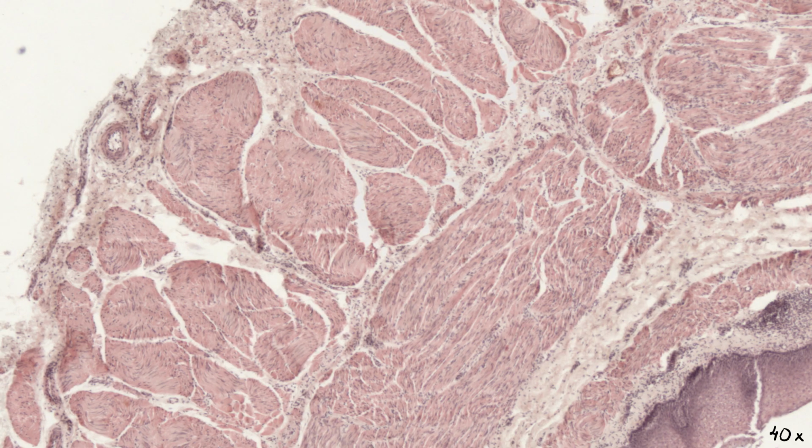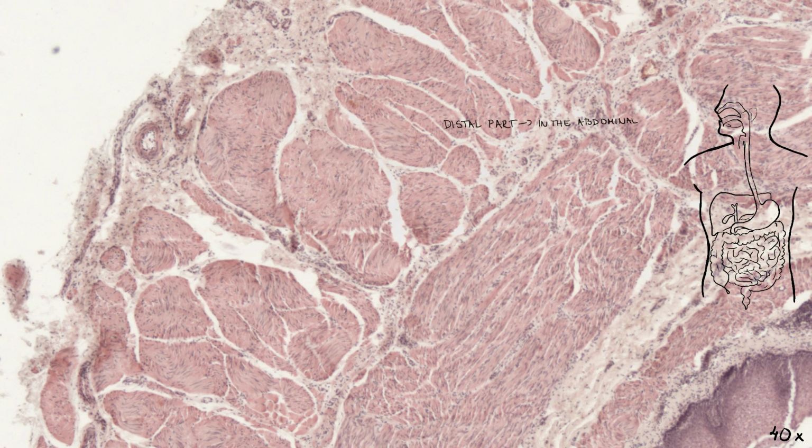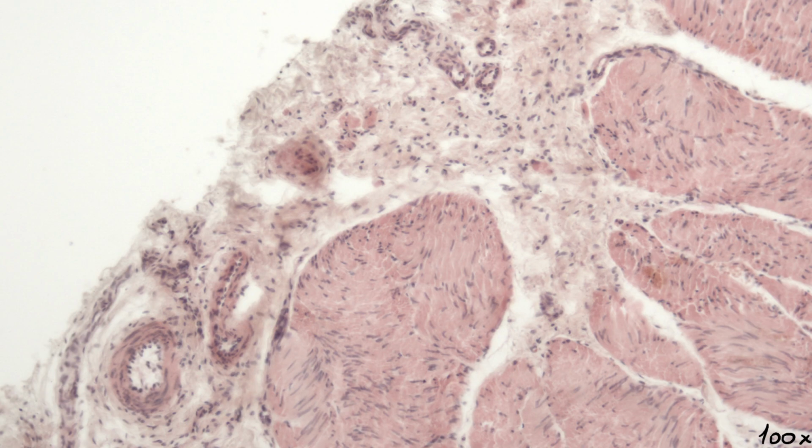Distal section of esophagus is located within the abdominal cavity, where it opens into stomach. This part is covered by serosa, but the greater part of esophagus is in mediastinum, where it's covered by adventitia, which blends into the surrounding tissue. Adventitia contains loose connective tissue and numerous adipocytes and vessels.